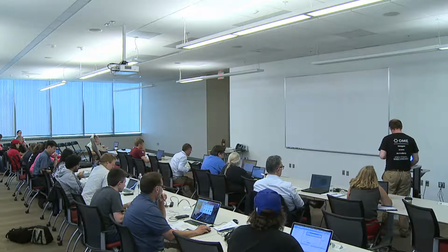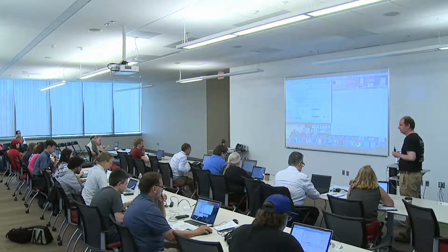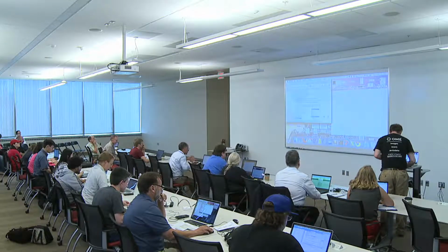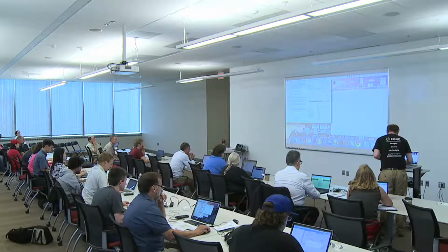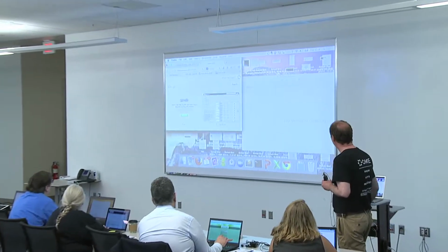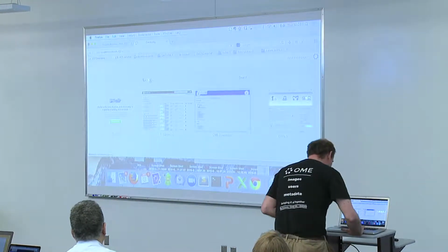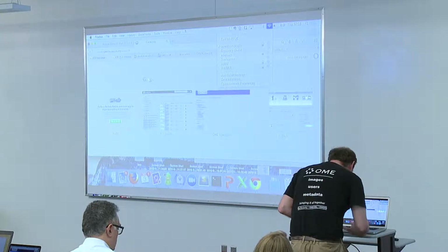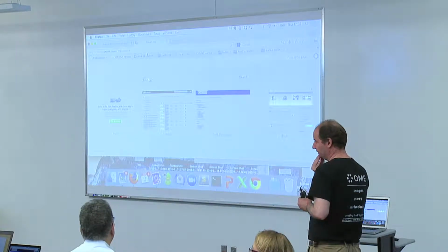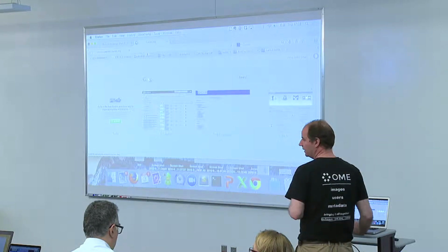Okay, so open your browser and write an address into the URL going tadpole.openmicroscopy.org, please. Any browser. Chrome, Firefox, Internet Explorer, your choice. Okay, so I'm opening a browser and writing tadpole.openmicroscopy.org. Can you see that? I'm hitting enter to go to the URL. You can't get there. Okay, then we have a problem. All of a sudden, I was connected to a server, and then they said connection shut down.